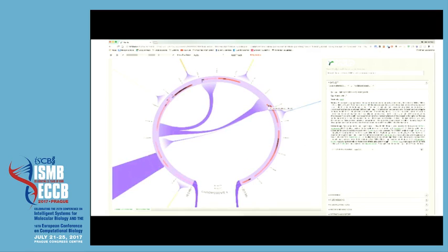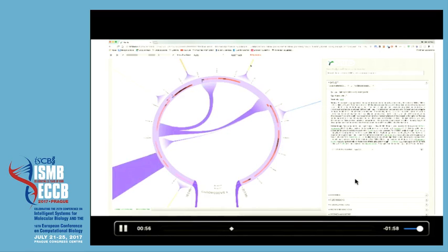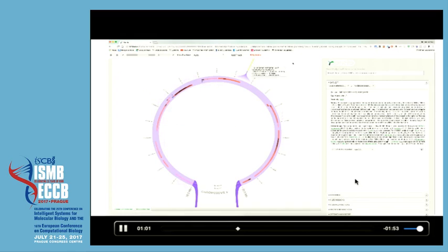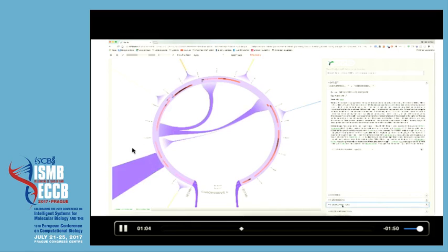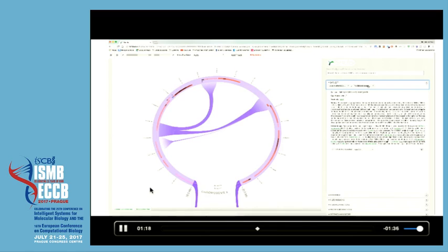and you have genes, and also you can filter connections by, sorry, going too fast for the video. So now I'm checking these trans connections, and down here in purple, this one is a connection from a different area of the same chromosome. This is chromosome X. So you can filter connections. For example, here I'm filtering out everything that is trans, and then everything that is outside this view, which is super nice when you want to create a nice figure for a paper.